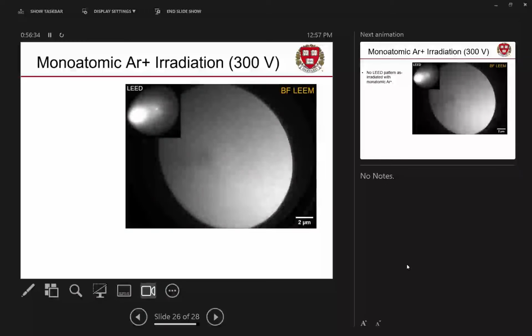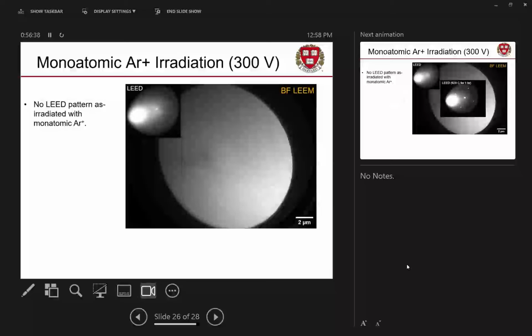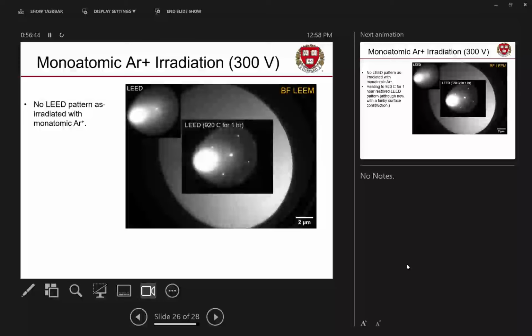Which is not really a surprise, because if you cross-section this and put it in the TEM, it's a little out of order. No diffraction pattern unless we heat it really, really hot, which we didn't want to do. That was not the point. But if we do heat it really, really hot, we get our crystal back. Except now it's weird. It's got all these additional spots all over it that it shouldn't have, because we got a funny surface termination by heating it up so much and also by sputtering it.